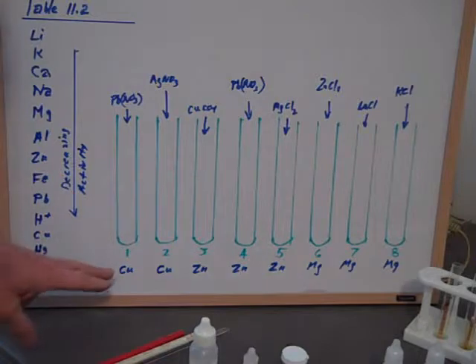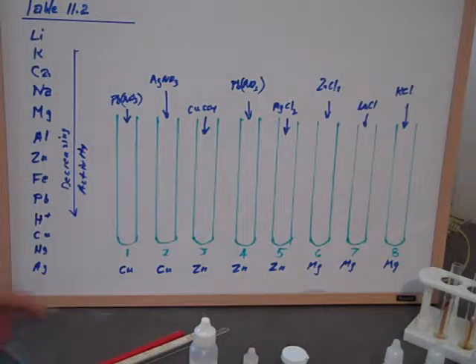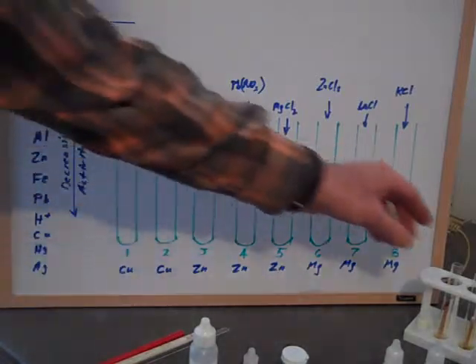And these test tubes are numbered one, two, all the way through eight. The first two have copper strips in them.